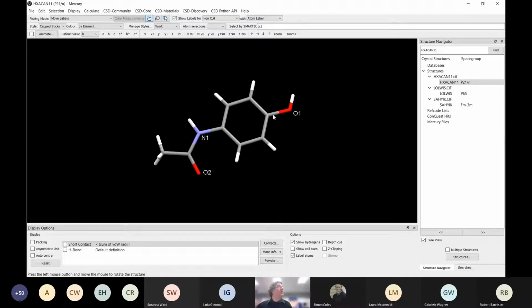Now, if you decide, okay, I've picked these, but I actually don't want to have, let's say, this O1, then if you right click on the atom it's next to, do labels, and we can do hide label, and we just lose the label. This tab up here overrides what's happening. So when you do label atoms, they'll appear again. So when you click this one, it's only which ones you actually want to mention. That's fine. So we've got atoms labeled.